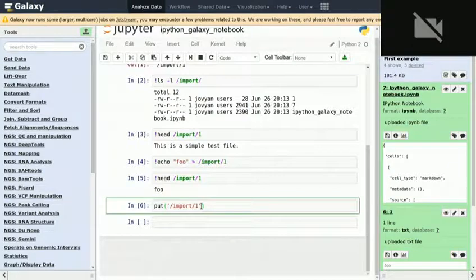Oh, it's just a simple question. I'm not sure if you mentioned it, is there a way to get something into the IPython notebooks, where you first have to give the number in the history? Like someone has some sequencing data you want to load in, but their number is different. So you can do whatever you want on this notebook. If you get a curl or wget command, you want to get some GTF files, some annotation files. But if it's just a different number in the history, does the user have to specify it themselves? Yes, they have to change it.